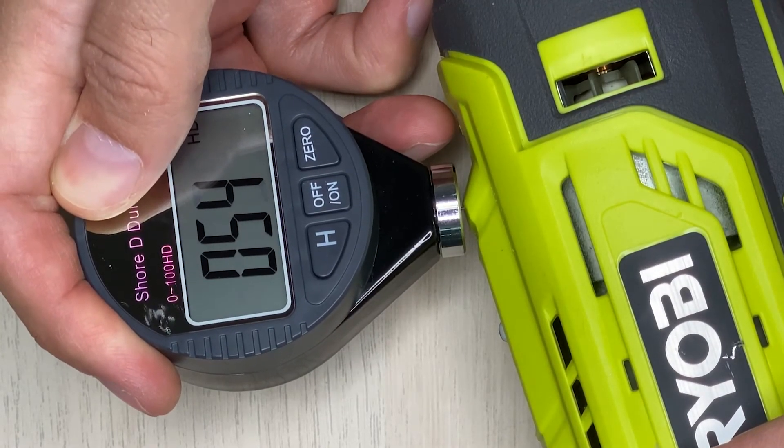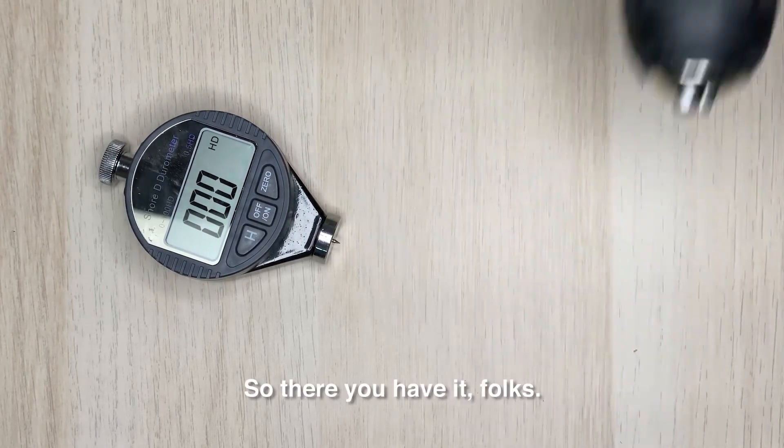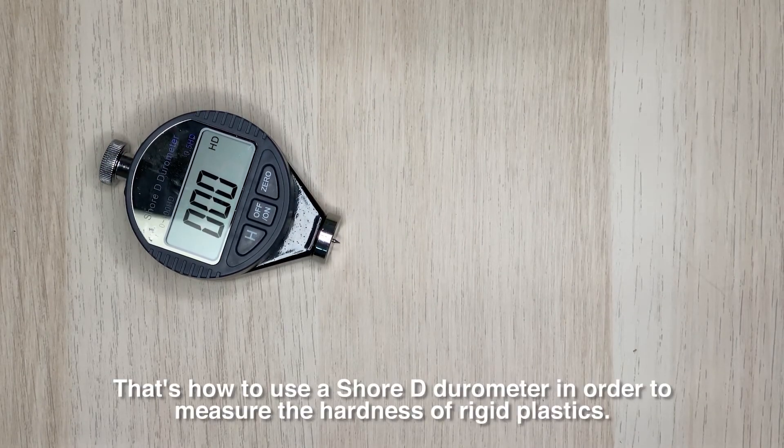So there you have it — that's how to use a Shore D durometer to measure the hardness of rigid plastics.